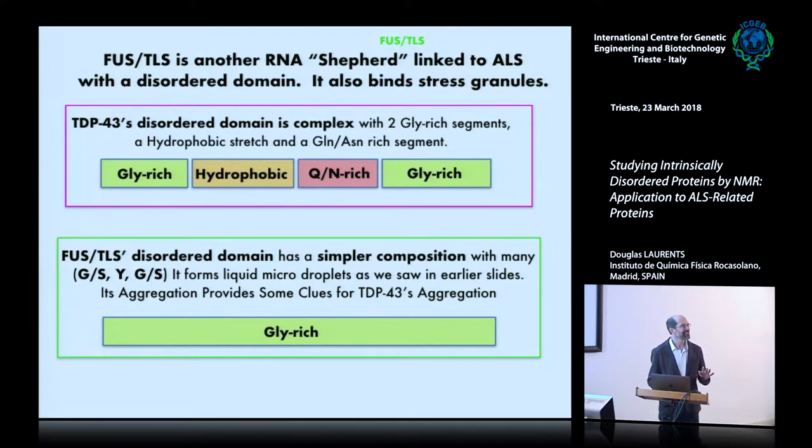Am I talking too fast? Okay, good. So we can use FUS-TLS as a simpler system to start looking at the aggregation process and see what these aggregates could look like.